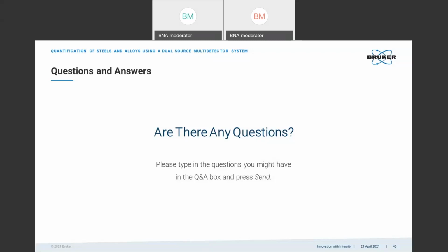Okay, thanks, Michael. And I guess a follow-up to that in relation to kV and what you just mentioned there is, what are typical acquisition times that were used for your data collection in these examples? Acquisition times depend on the statistics that you want. So the longer you acquire, the better the statistics will be, because that means more counts, and more counts means better statistics. I checked the sigma value to get the statistical error somewhat below 10%.